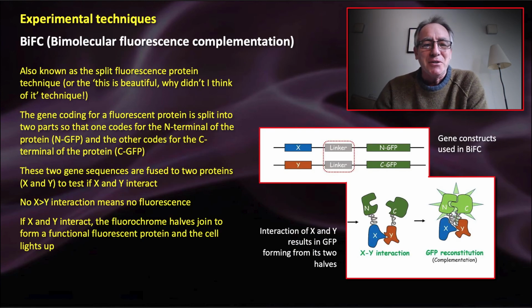Bimolecular fluorescence complementation, which I've said is also known as the split fluorescent protein technique, or the "this is beautiful, why didn't I think of it" technique. When I first heard of this one, I thought, that is so cool. That's amazing that that works.